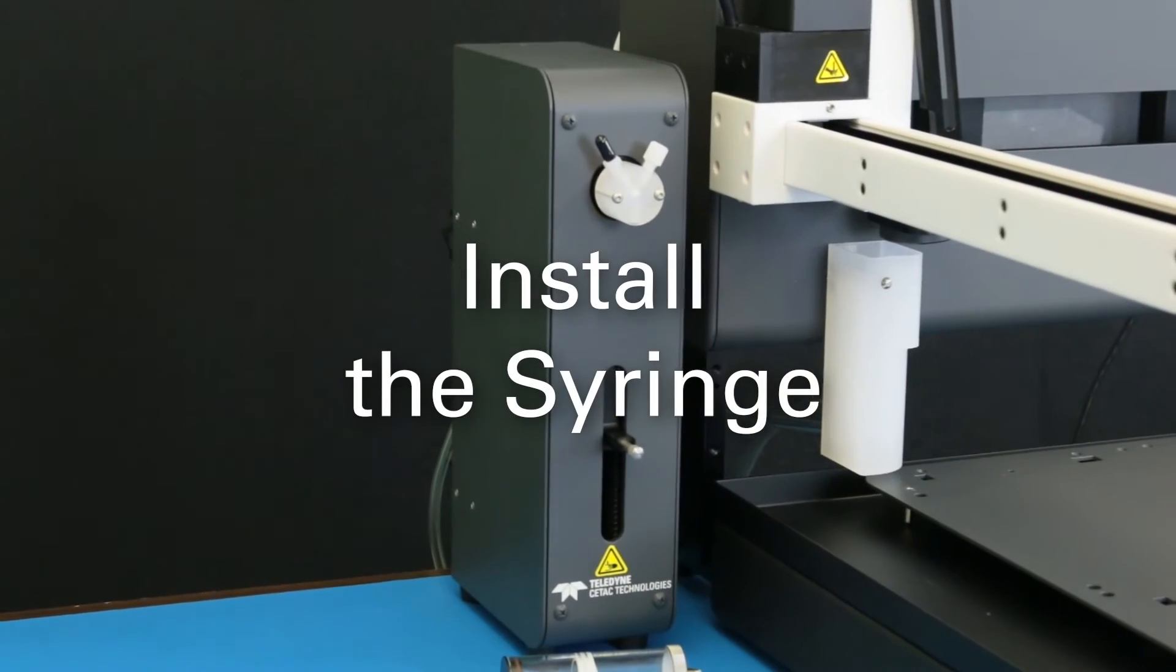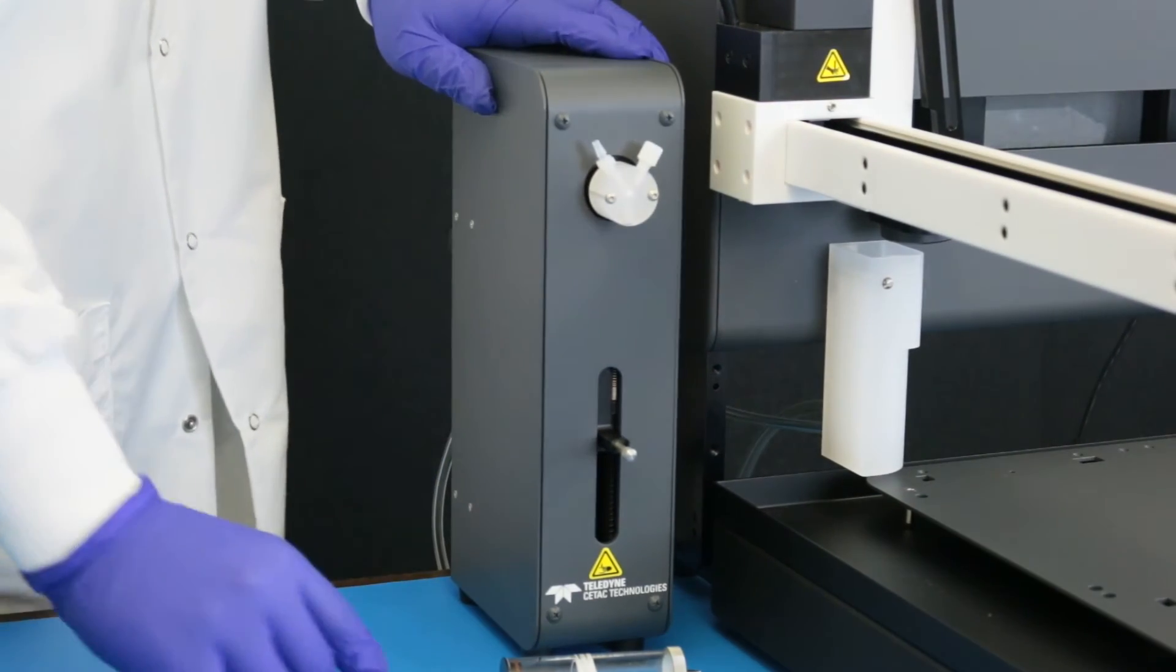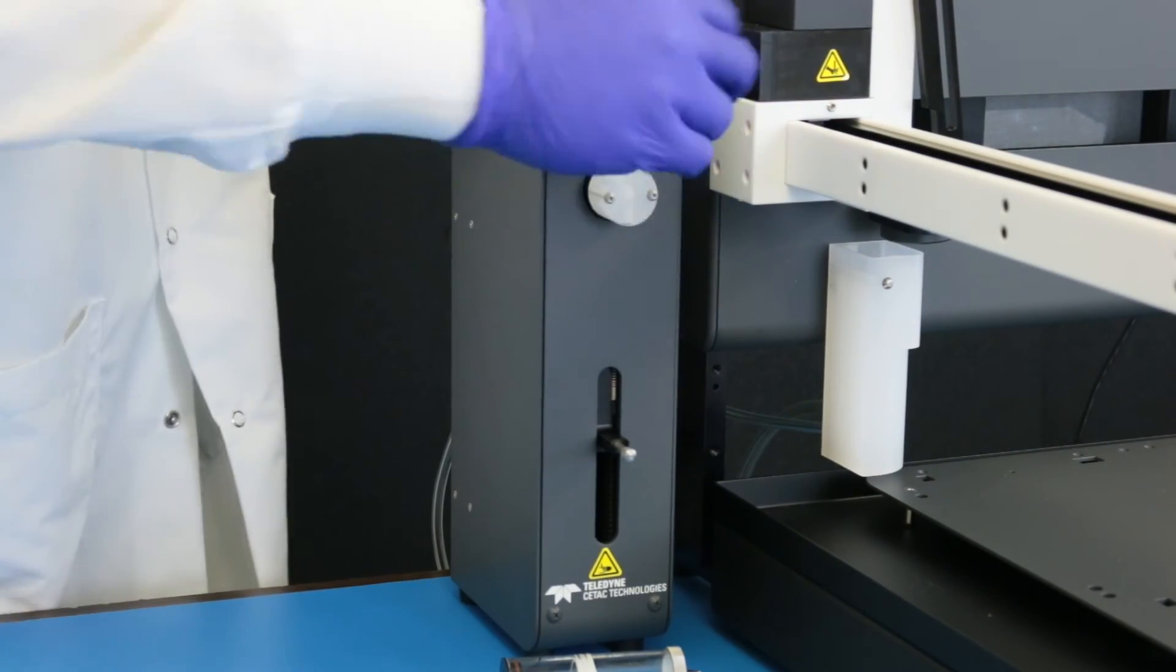Install the syringe. Remove shipping caps from the valve and the thumb screw from the probe's actuator arm.